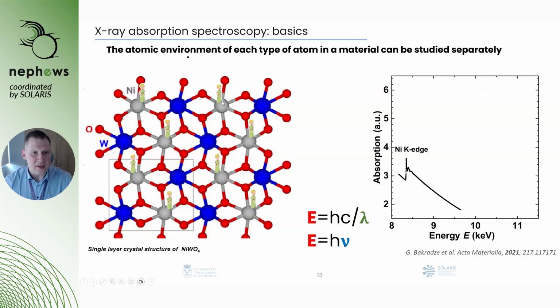These small princes can give us information about their planet, for example the oxidation state of nickel, its electronic structure, and also the local structure of nickel in the system. For example, they could say that in the first coordination shell, they see 6 atoms of oxygen. Further away, they see planets called Wolfram or nickel.